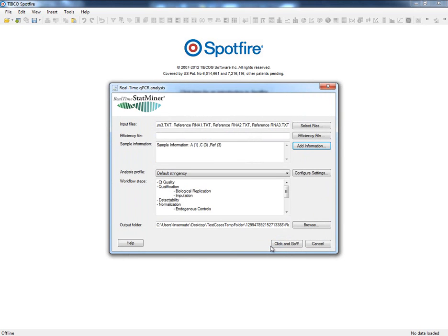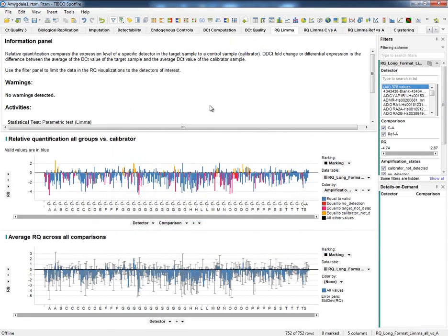So that is all. Our design is done, and now that we have configured the settings, we are ready to perform our analysis. We are going to finish this tutorial by speaking very briefly about the differential expression tools in terms of how to define the new biological conditions that we might want to compare and analyze. Once our main qPCR analysis is done, these tools will allow us to dive deeper into our statistical analysis.